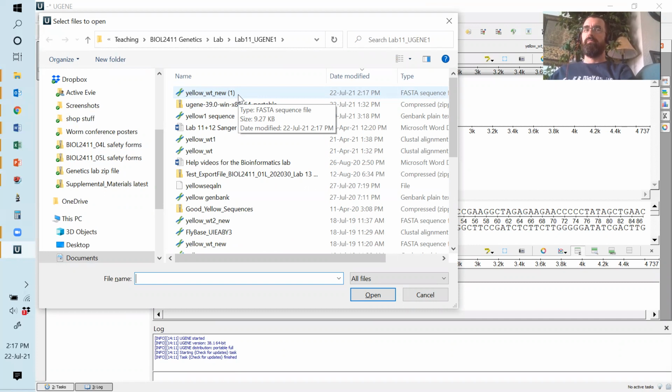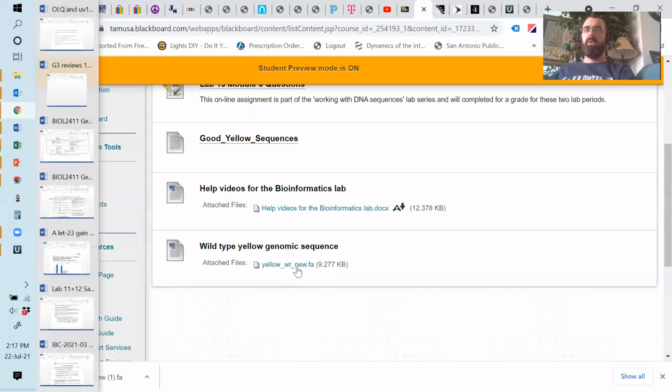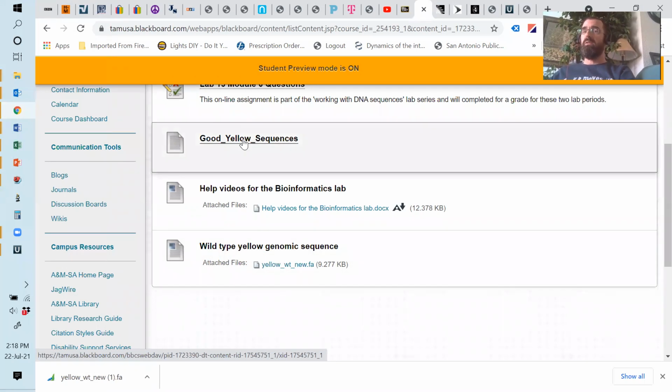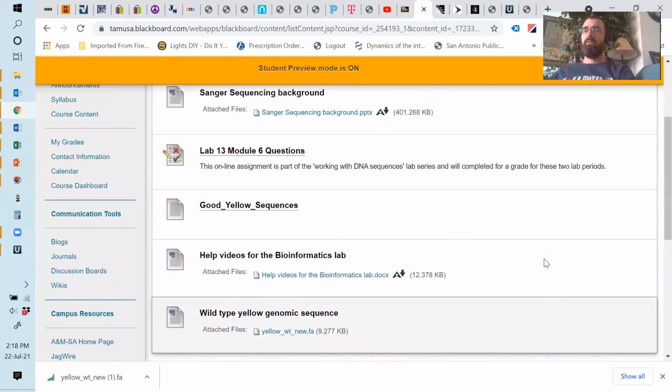Just the whole save portion, because every single time I click on the hyperlink, it doesn't prompt me with the option of saving it. What about this? If you click on the blue lettered bit down here. Yes, if you click on that, it doesn't give the option to save it. Correct. Oh shoot, I don't really know then, to be honest. Don't worry about that bit. Can you at least download the yellow sequences, that folder, the zip file? Let me try. Because you'd be kind of screwed if you can't.